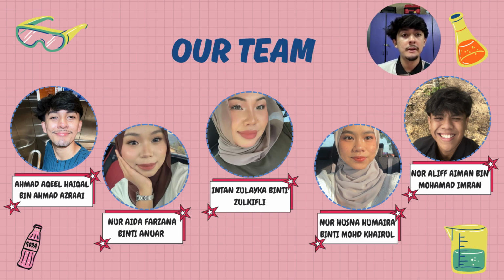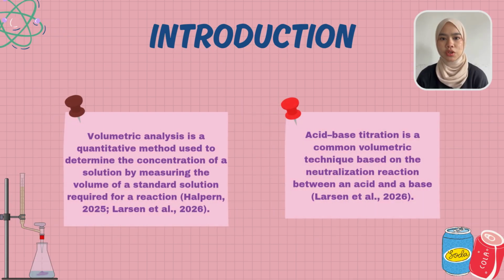Volumetric analysis is a quantitative analytical method used to determine the concentration of a solution. It measures the volume of a standard solution required to react completely with the analyte. This technique is widely used because it provides accurate and precise concentration measurements.